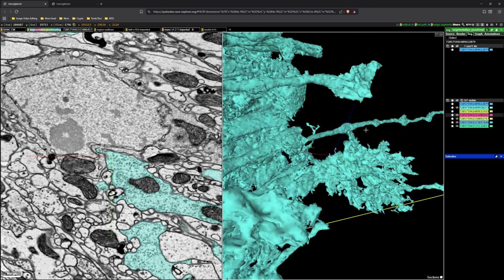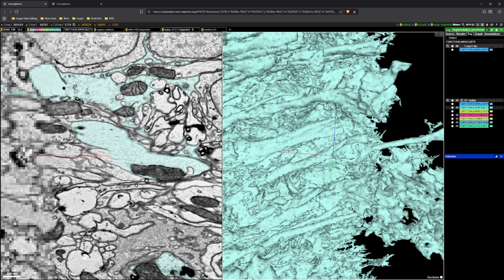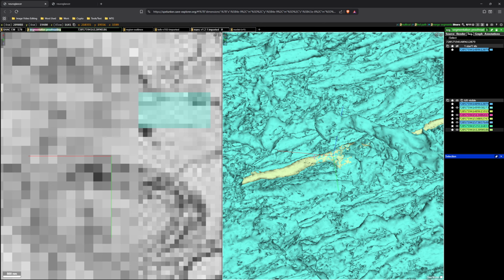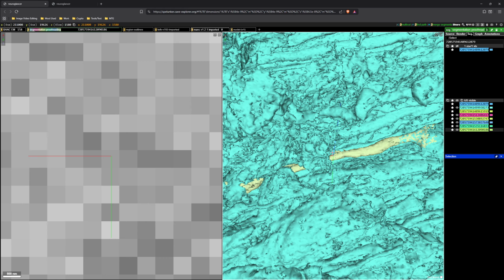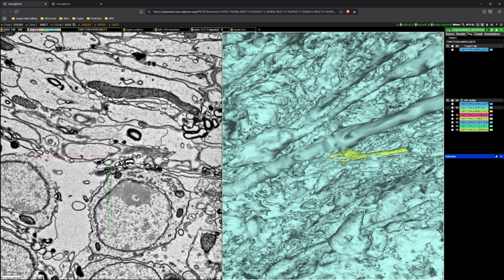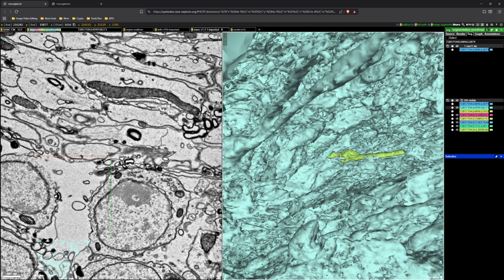So this is our original example. And as you can see, it's entering the merger here, right? But really that pink piece from before, which is now merged, already kind of went in further. So you want to take it as far as you can go until it gets untenable, right? So maybe around here, you would say, okay, that's far enough. I'm going to put a point here, point here, point here, point there. And we're just going to take everything from here up, right?